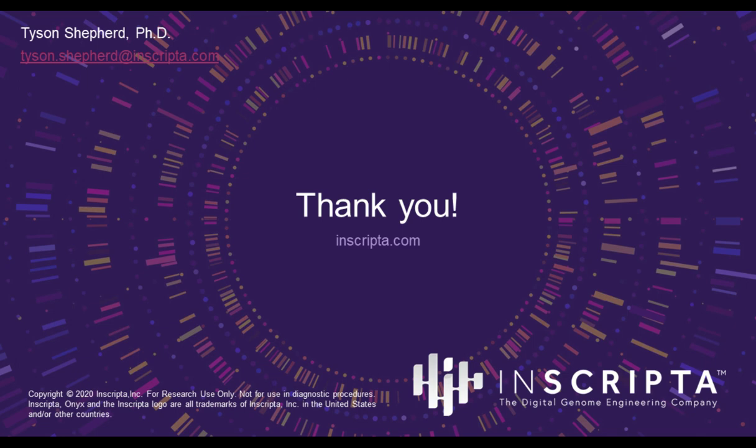That's a nice question. Thanks for asking that. That's an application that I think is particularly interesting for this technology, because, as you've seen even with the data shown here, you can make variants within a protein itself. You could imagine applying this technology for codon optimization of a particular gene that's integrated into a genome. You can modify promoters.